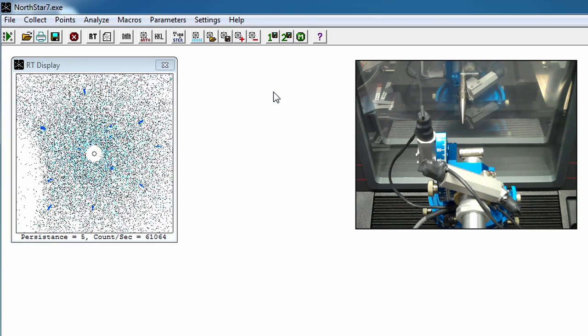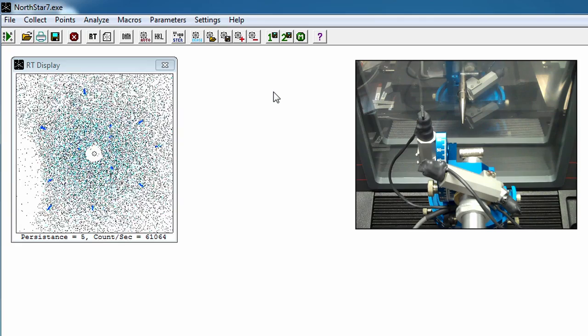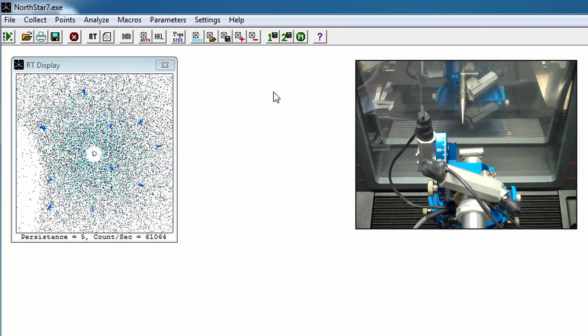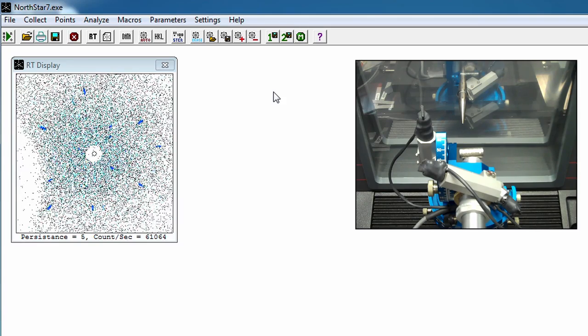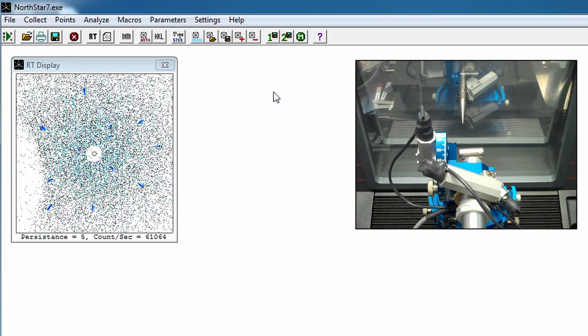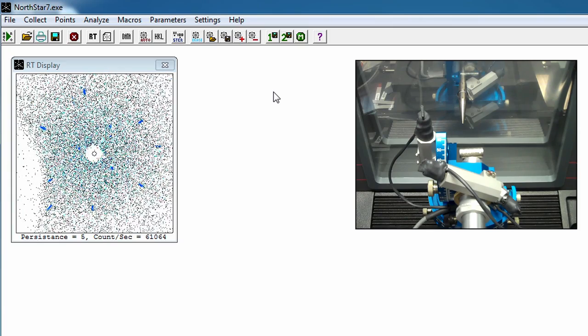The ability to translate the sample, and therefore look at different parts of the sample, is extremely useful. In some crystals, you can see optically where grain boundaries are, but in many materials, using the MWL120 X-ray detector system is the best way to determine where grain boundaries are.